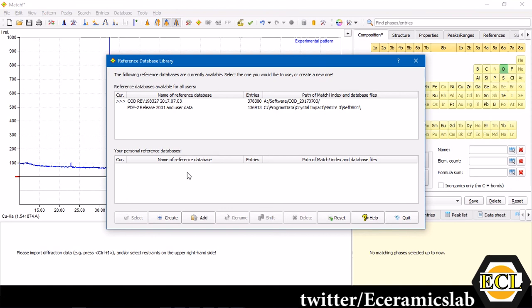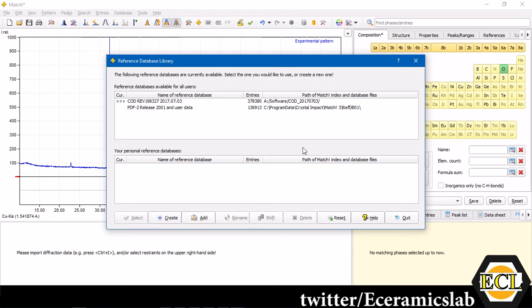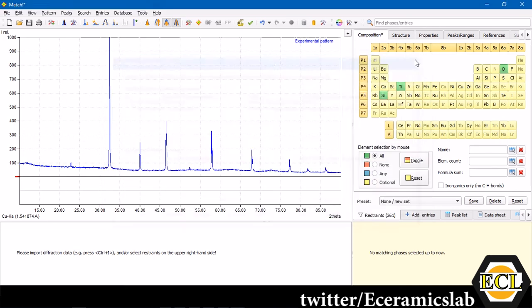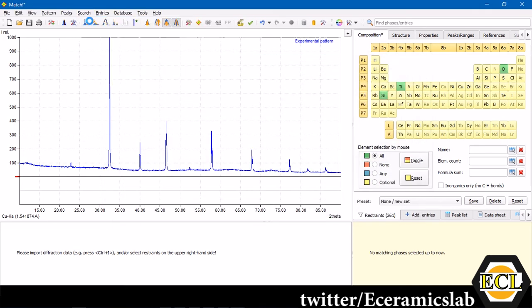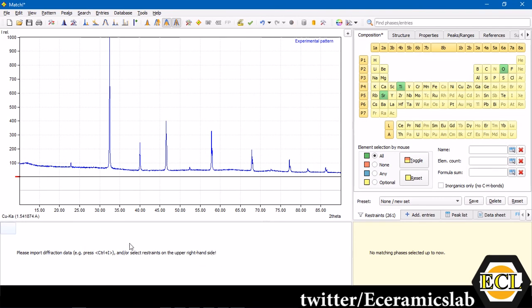You can feed that database from here and you can click select or create reference database. Here you can see I already have selected Crystal Open Database, which is already fed into the system. If you do not have the database, then you can click over there and go to that folder and select it. I'll click Search Match.